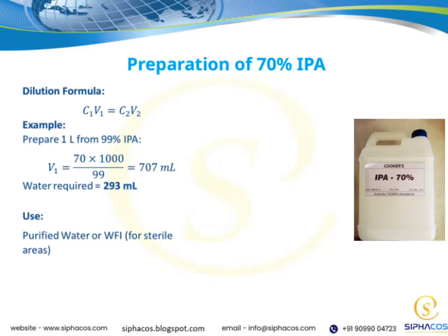Today, I'll be talking about the preparation of 70% IPA, which is a crucial step in our sterilization process. First, it's important to understand that IPA, or isopropyl alcohol, at this concentration is highly effective for disinfecting surfaces and instruments. To prepare this, we typically start with pure isopropyl alcohol and then dilute it with sterile distilled water to reach the 70% concentration. This specific ratio is key because it optimizes the alcohol's ability to penetrate cell membranes and denature proteins, ensuring effective microbial kill.